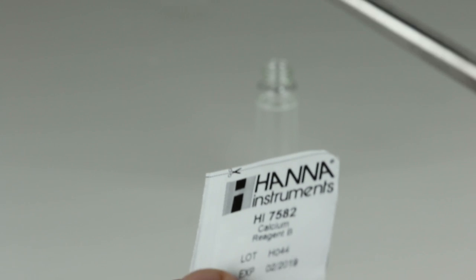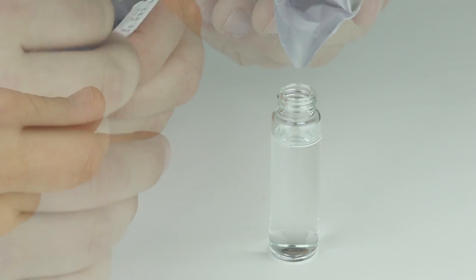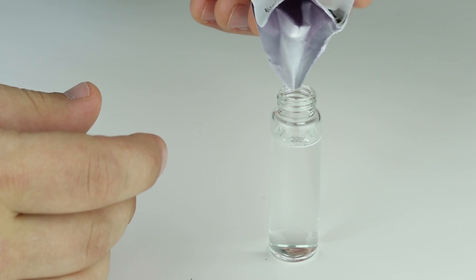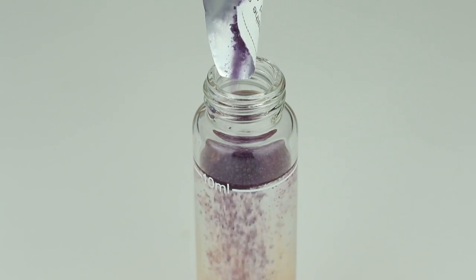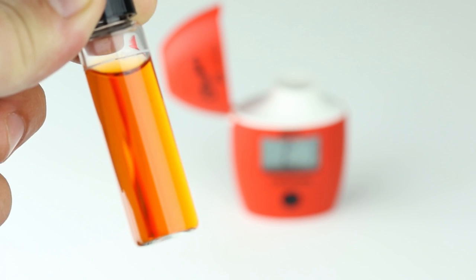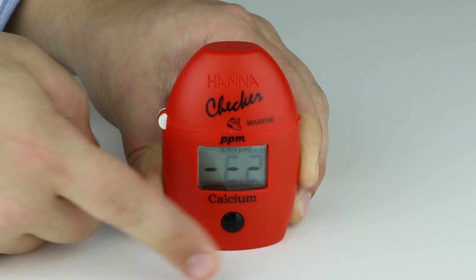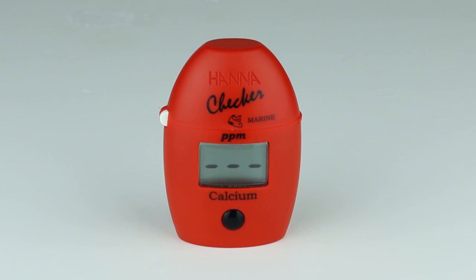Once the sample is added, add one packet of reagent B to the cuvette. Cap the cuvette and shake vigorously for 15 seconds. Wait 15 additional seconds for bubbles to dissipate. Place the cuvette back into the meter, close the lid, and press the button. The meter will display the concentration of calcium in ppm.